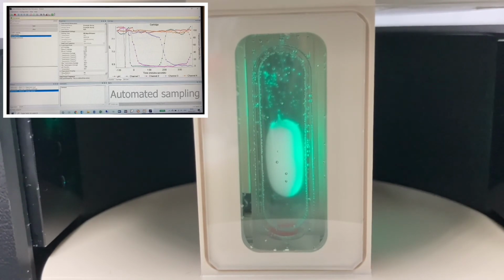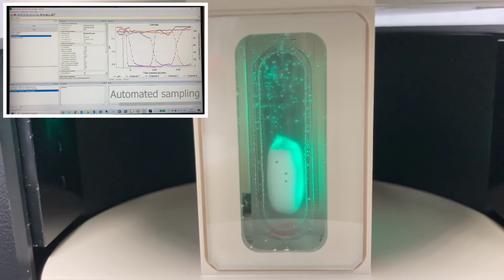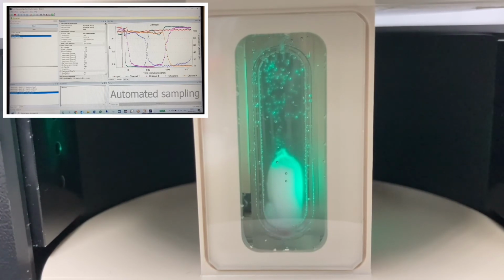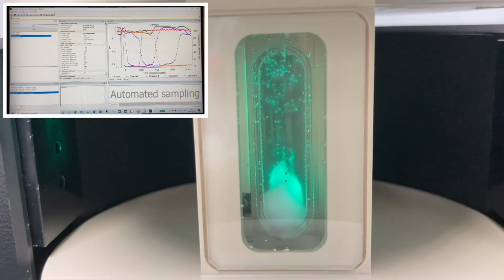As the formulation migrates, channel 1 and 2 in green and pink recover back up to 100% transmission, and channel 3 and 4 in purple and orange then become obscured. As the formulation starts to reside at the bottom of the cartridge, all of the top 3 channels return to 100% transmission and only channel 4 in orange remains obscured.